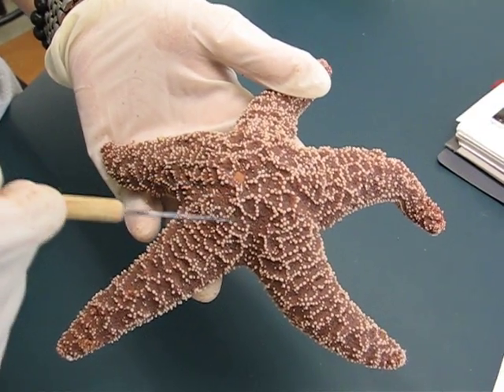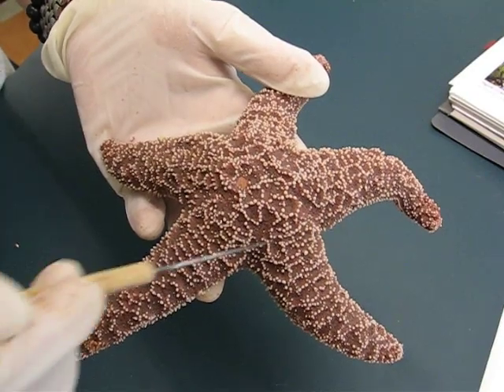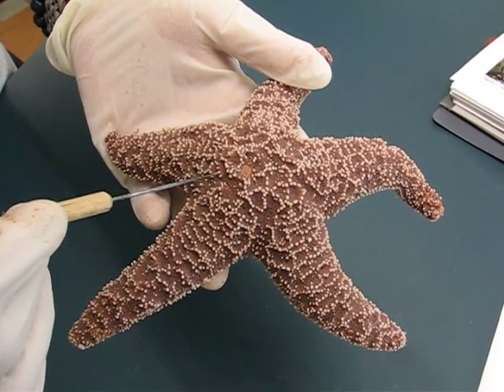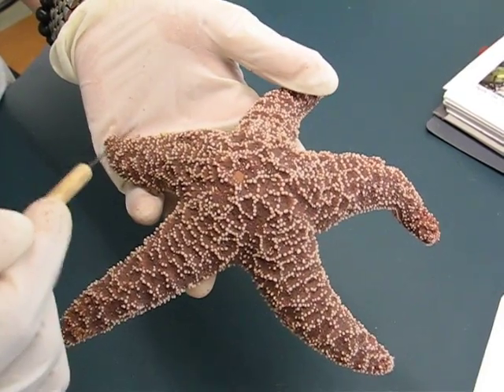Okay, go ahead. So we start off at the central disc, which is this area over here. The arms — obviously you can see them — there are five of them.